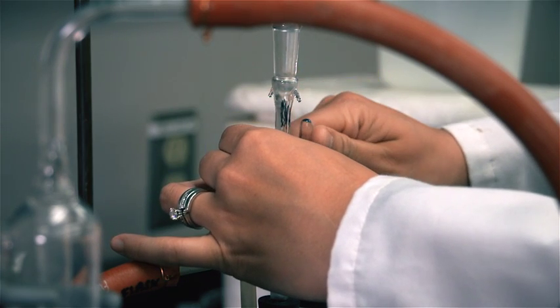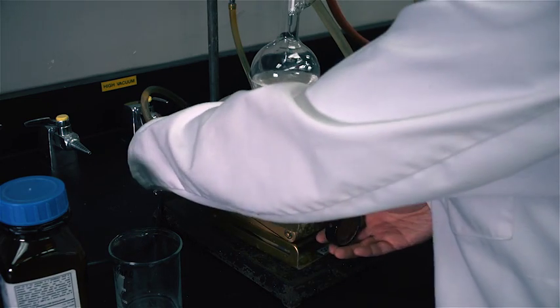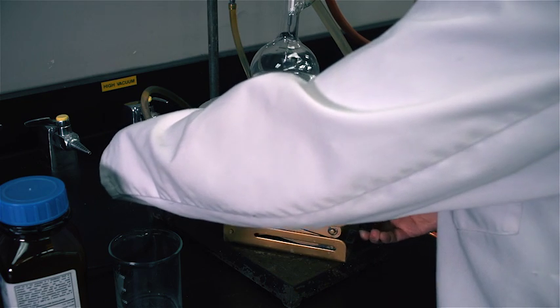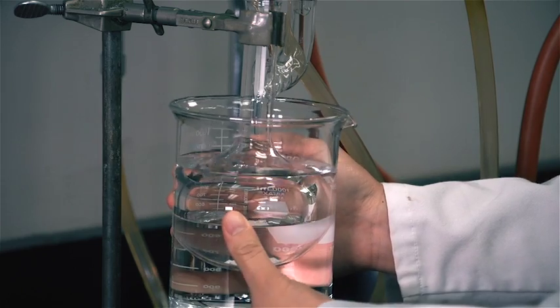Open the system by opening the stopcock on the safety bottle. Remove the heat source and set it aside. Do not turn it off. Cool the liquid in the boiling flask using an ice water mixture if required.